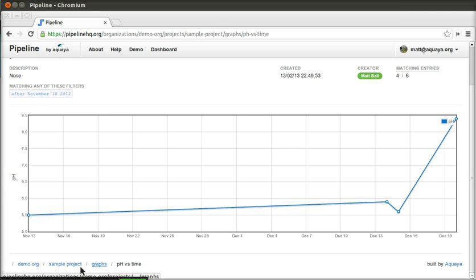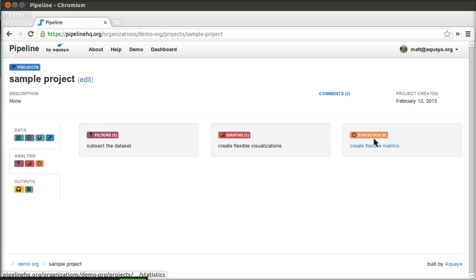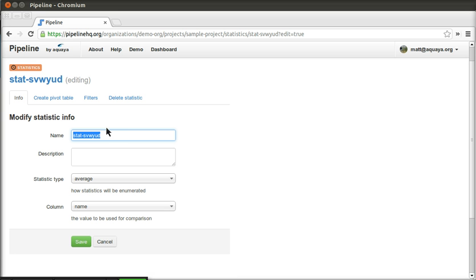Let's create a statistic too. I'll go back to the project and select statistics. Let's look at the maximum turbidity.